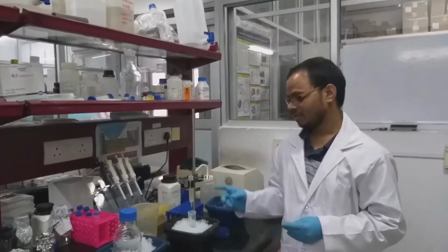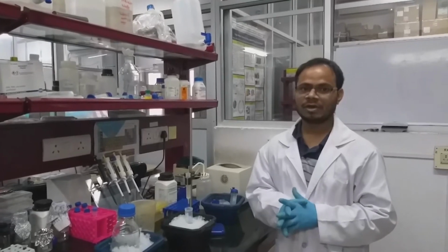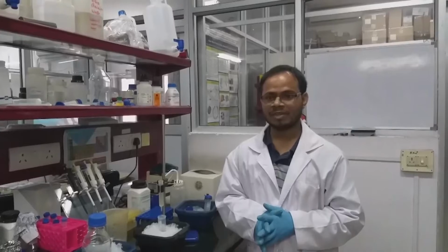The next step is we have to wash with the equilibration buffer. And the third step is we have to elute the protein, the His-tagged protein, using imidazole containing buffer.